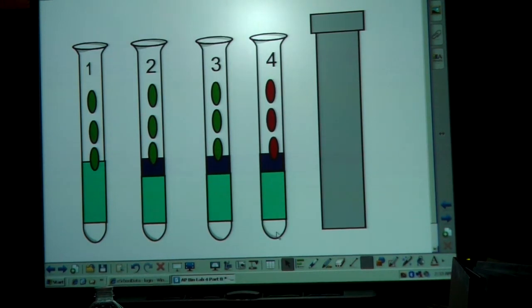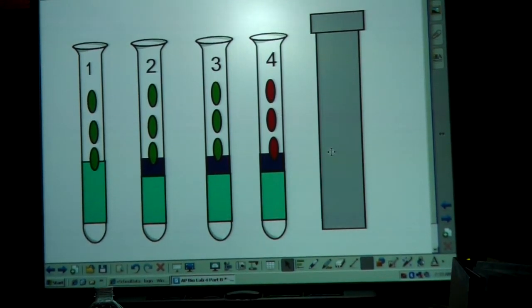Number four, again, one mil of the phosphate buffer, three mils of distilled water, one mil of the DPIP, and three drops of the boiled spinach extract.